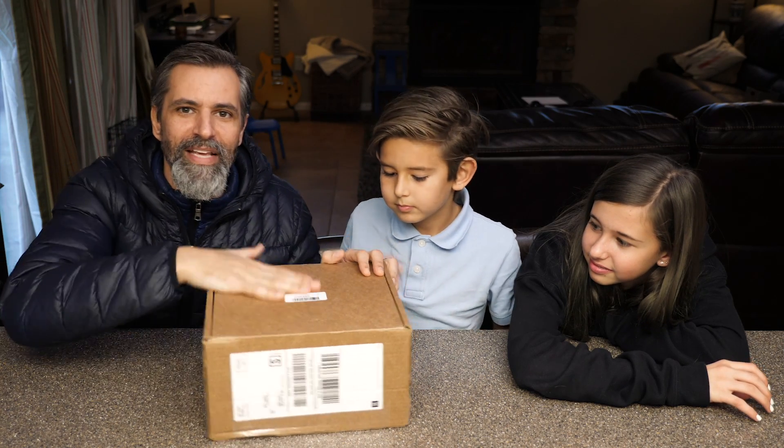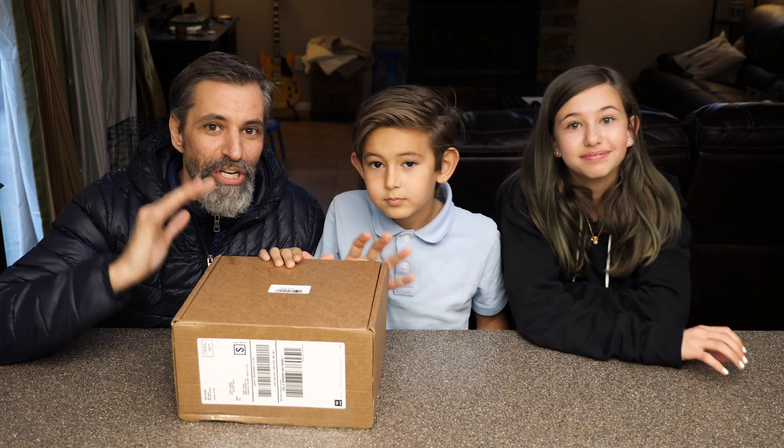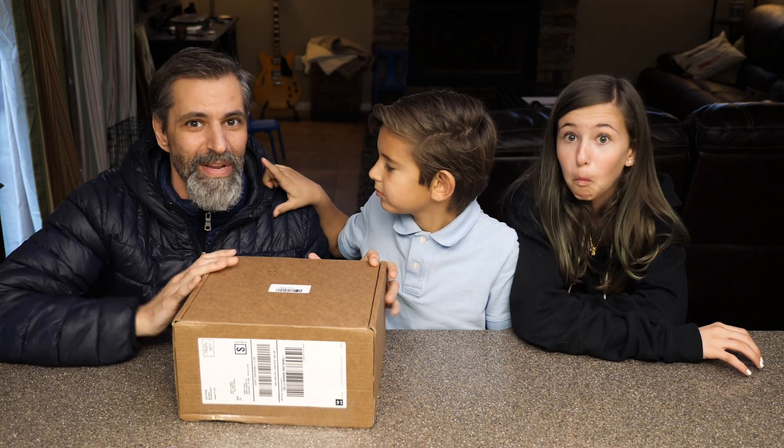Today we're doing a quick video because I'm trying to get ready to go out of town to San Antonio. By the time you're watching this, that was already in the past. We're time travelers. We're doing a quick unboxing and we're gonna open this thing up and do some of the stuff in it — quick and cool.